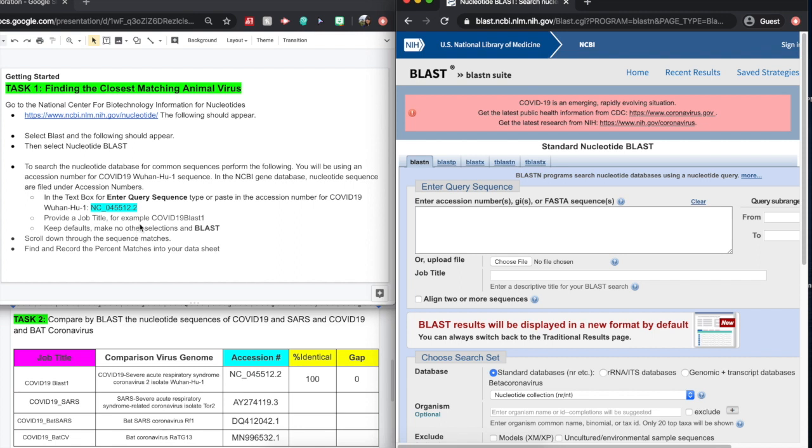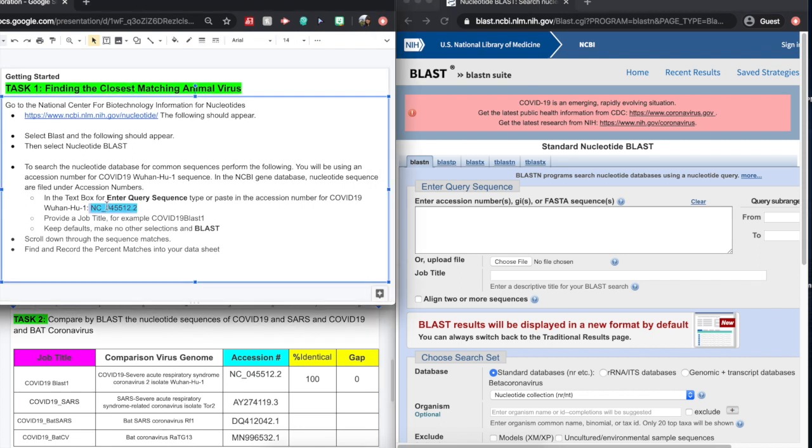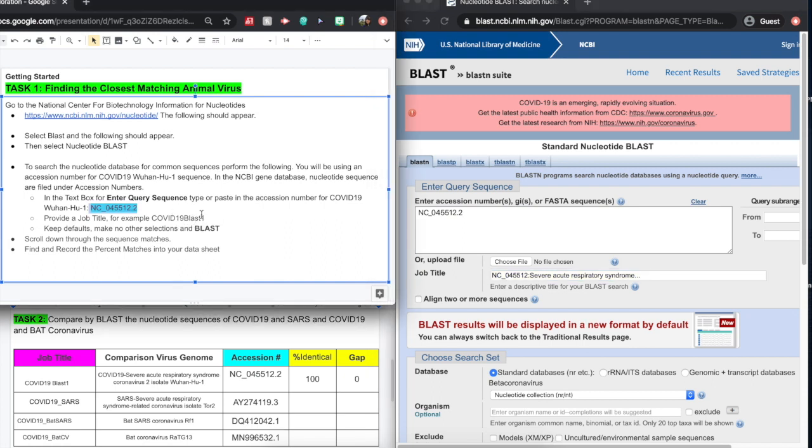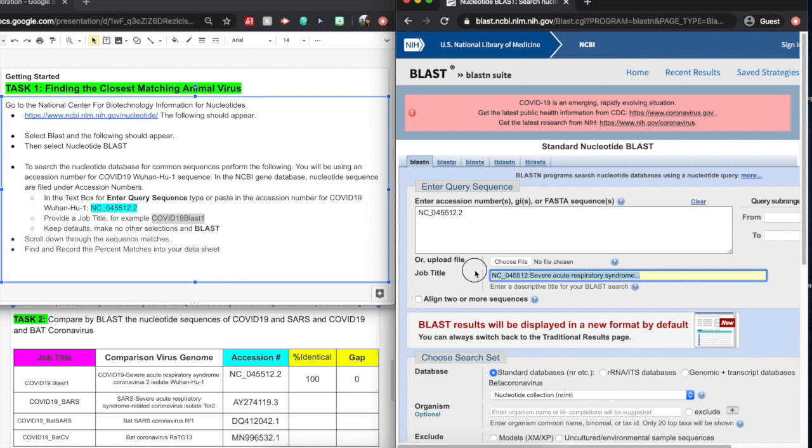Now, we want to be able to compare the COVID sequence. So we're going to use the accession number here. I'm just going to copy and paste that and pop that right into the query box. I want to give it a job title, so I'm going to copy and paste this job title and pop it right into the job title box.